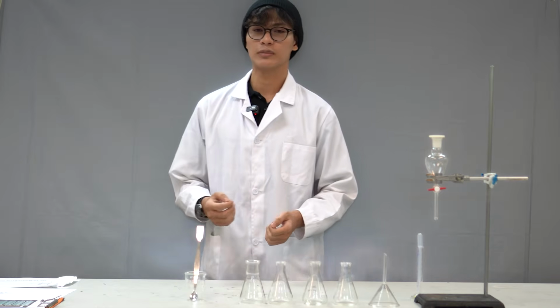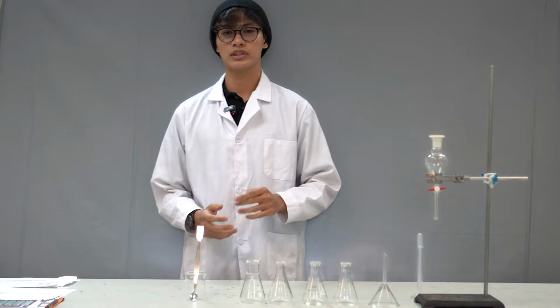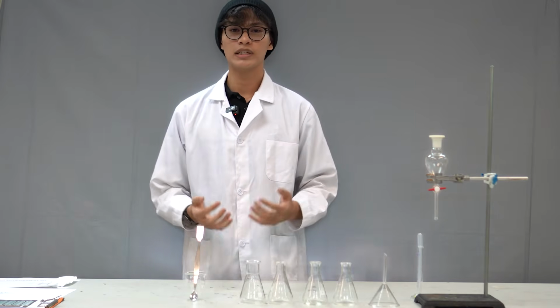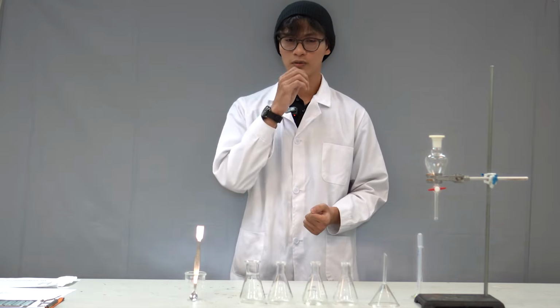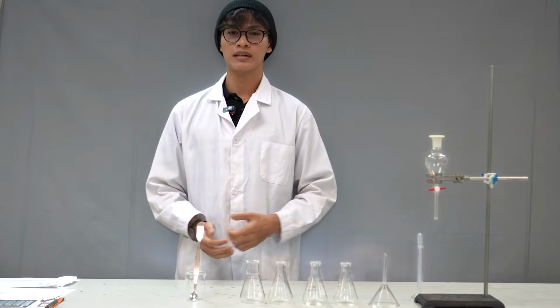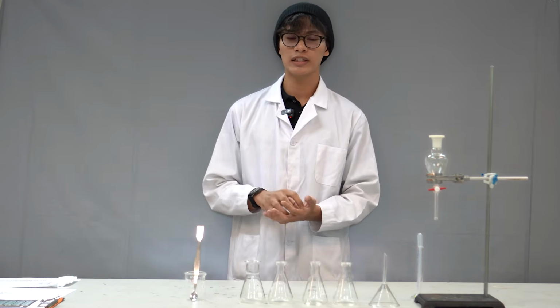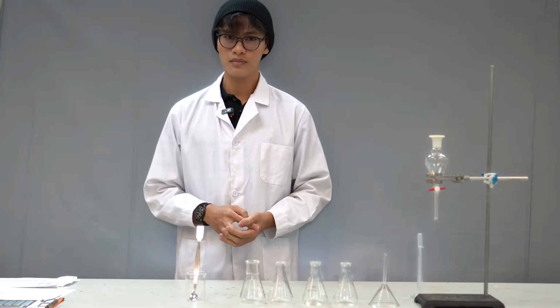One such method of separation is the separation of the constituents of the mixture into three classes, which are basic, acidic, and neutral. Which brings us to our problem statement. Naturally, a complex mixture will contain other compounds, and some of those compounds we may not need, so we call them impurities. So, how do we identify and separate these impurities from the mixture in order for us to obtain its pure form?